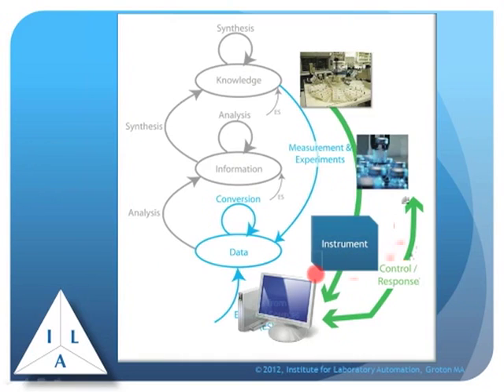And that workflow model we looked at looks like this. We've got the sample preparation system, the auto sampler, the instrument. The computer system straddles this entire area, from doing data acquisition through storage, and as you'll see in a moment, analysis. And we also have the control response loop as part of the system.